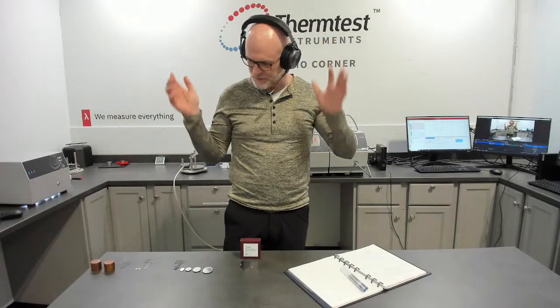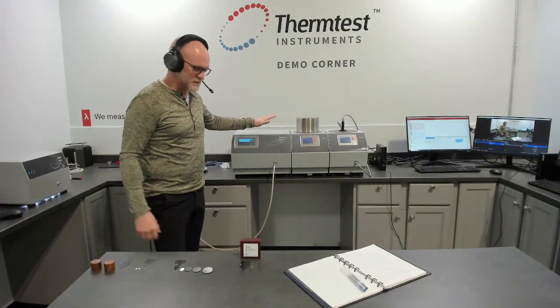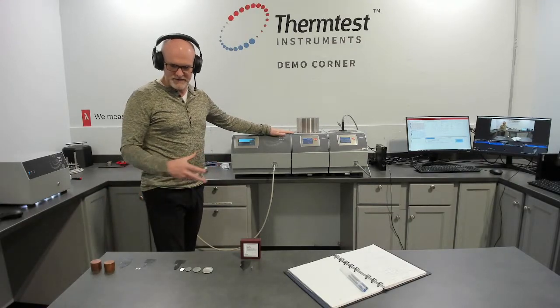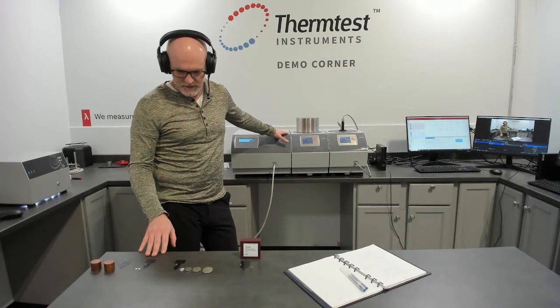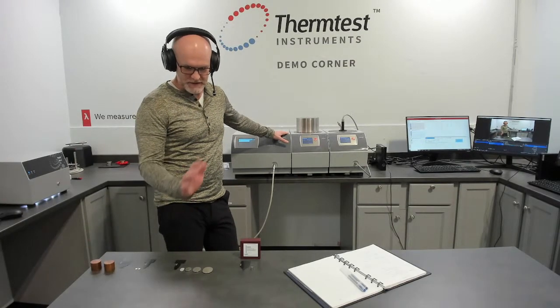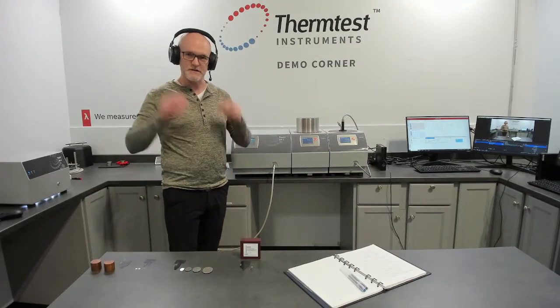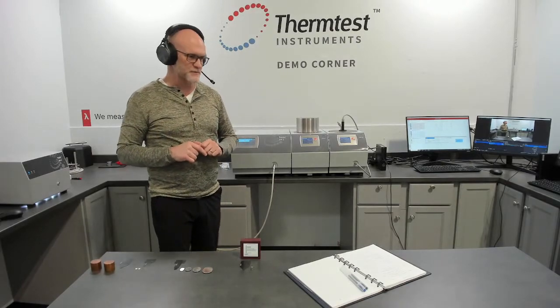Today we're going to talk about the power of short test times that are available on the MP-1 for the Transient Plane Source Method, and really how that ties into if you're measuring very small materials of a low to medium conductivity or small materials that are very conductive, how critical that is. But before we do, as tradition here in the demonstration corner, we're going to turn the camera around and just talk about the different methods.